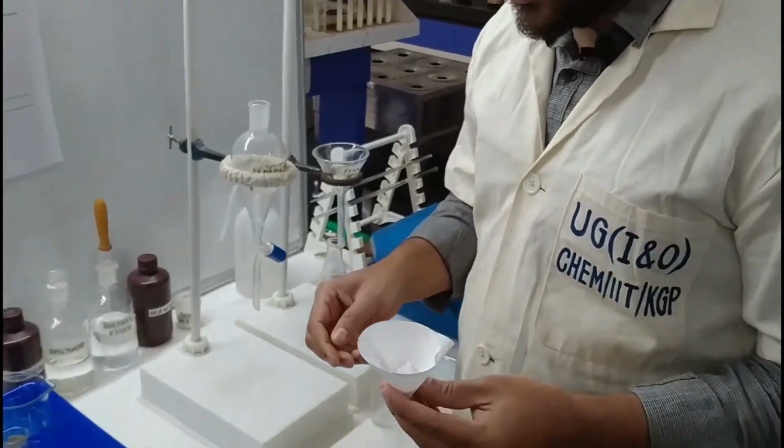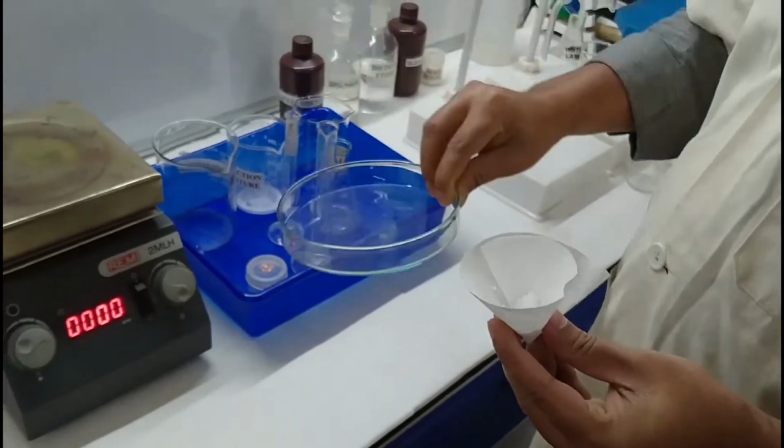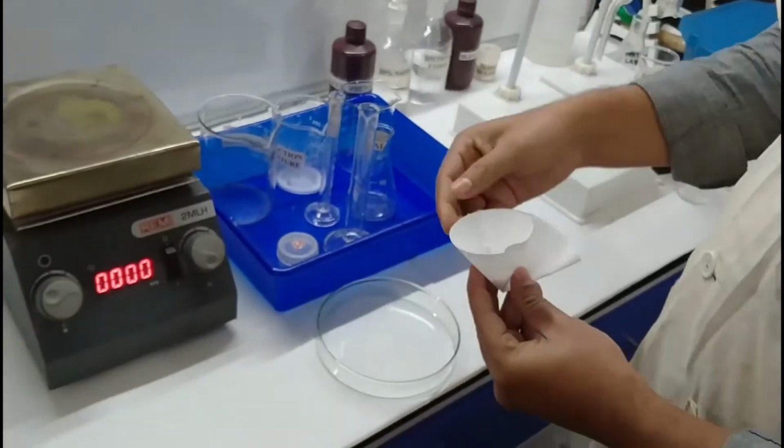Okay, so I am going to take the weight of this one. This is the petri dish. Using this, I am going to dry it.